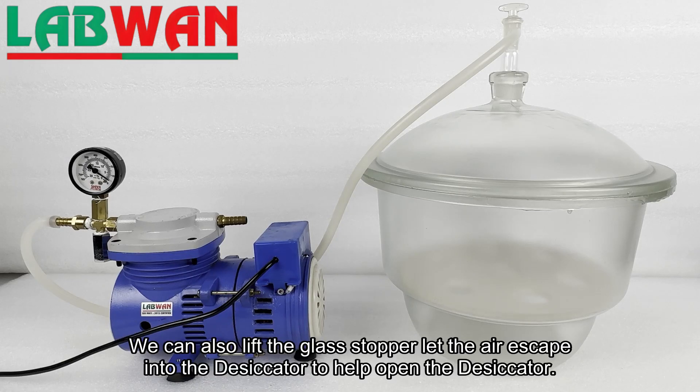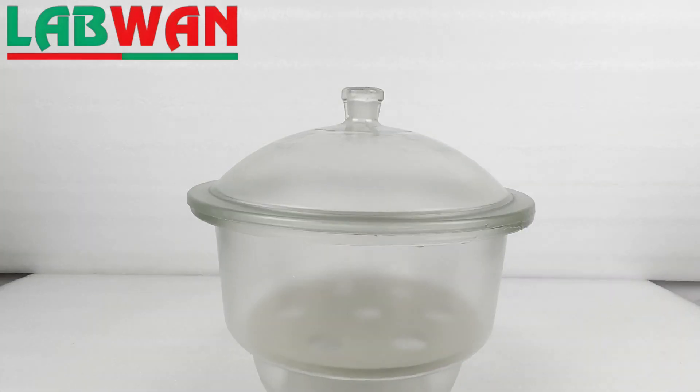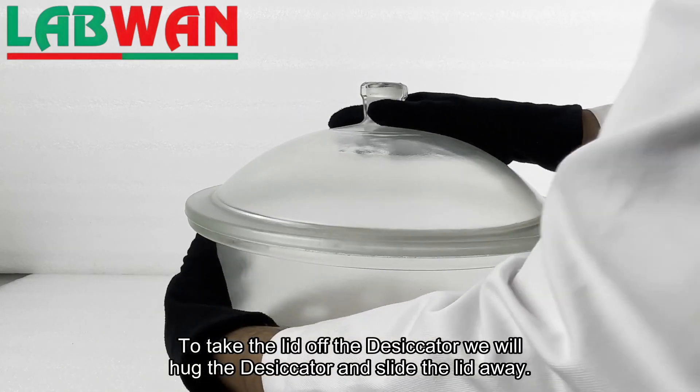We can also lift the glass stopper to let air escape into the desiccator to help open it. To take the lid off the desiccator, we will hug the desiccator and slide the lid away.